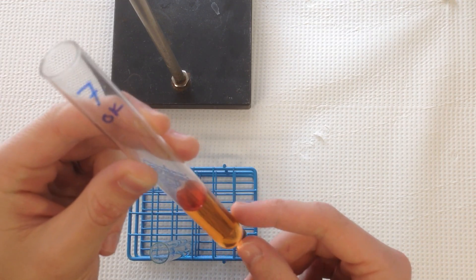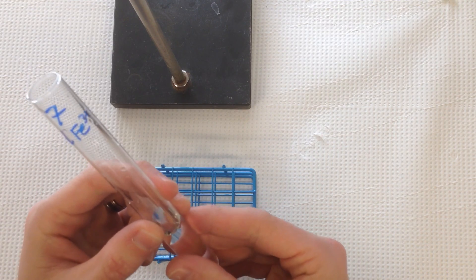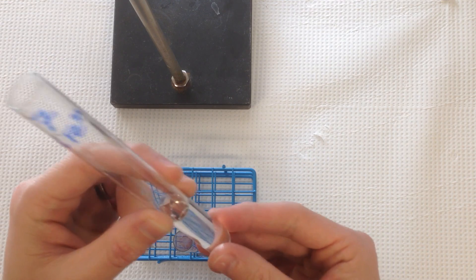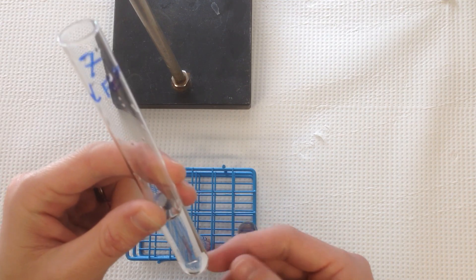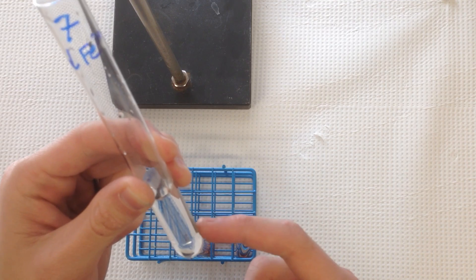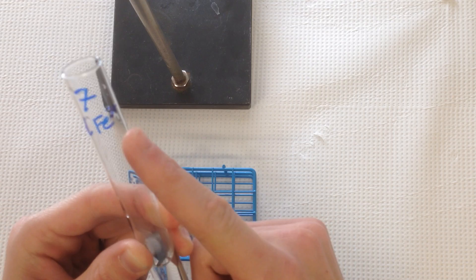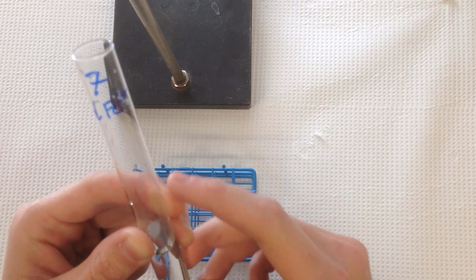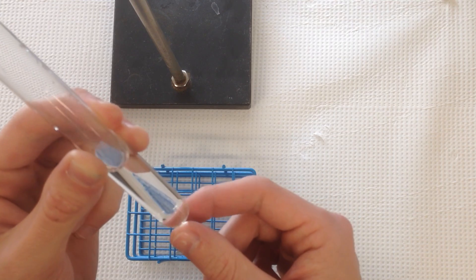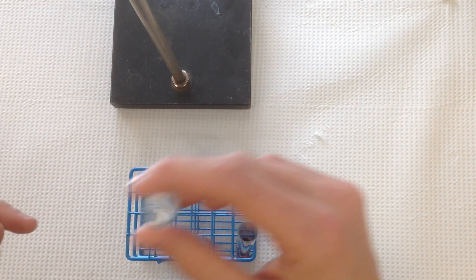If in test tube 7 you end up using the dilute iron solution instead of the stock iron solution — the .0025 molar stock solution — you end up with something that looks colorless. This is transparent because there's very little iron 3 in here because you used the diluted rather than the stock, more concentrated iron 3 solution. So not much product forms, and we see basically a colorless solution that looks a lot like water.